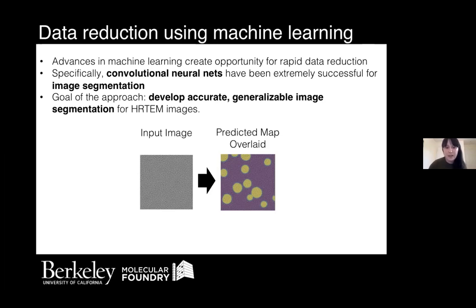It's not the complicated NanoDiffraction multimodal modality that I introduced first. This is really because so far our experience has been that we're closer to being able to automate imaging modes like this than some of the more complex imaging modes. So this was the reason for our starting off point. It's also dose efficient and is commensurate with other experiments like cryogenic experiments where you might vary the temperature, or in situ experiments where you might care about time resolution of your real space images.